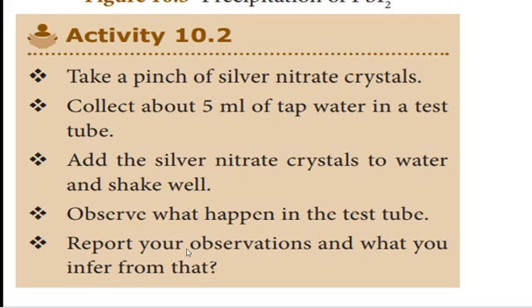The activity: take a pinch of silver nitrate crystals. Collect about 5 ml of tap water in a test tube. Add the silver nitrate crystals to the water and shake well. Observe what happened in the test tube. This is the reaction between silver nitrate and tap water.